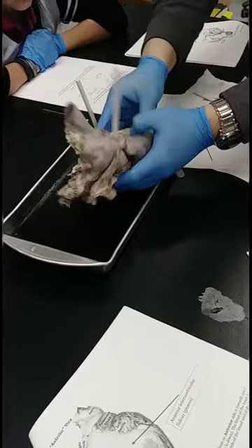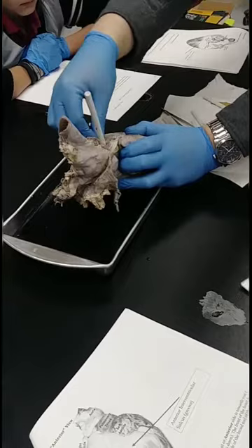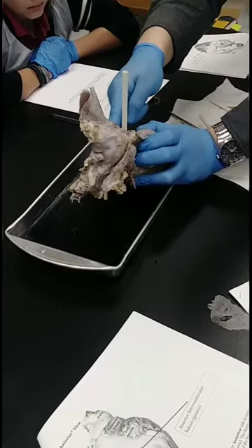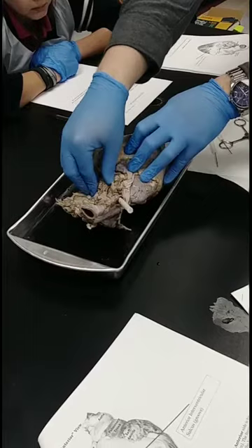Okay. Now here's the posterior side. You can see how it goes down into this. You can use the scalpel to cut away some of this fat. Make sense? You're going to have to do that. So let's keep that probe there so you can see just where it goes. But cut away some of this fat here. Make sense? Who's going to do that? Okay, so your scalpel. Have someone hold the heart for you and then cut it. Cut this fat off so you can see a little more of what's going on.